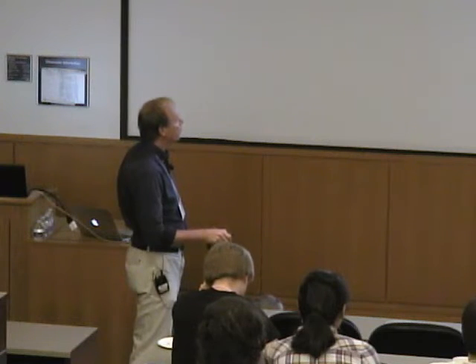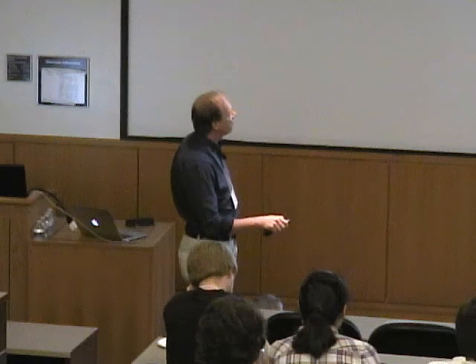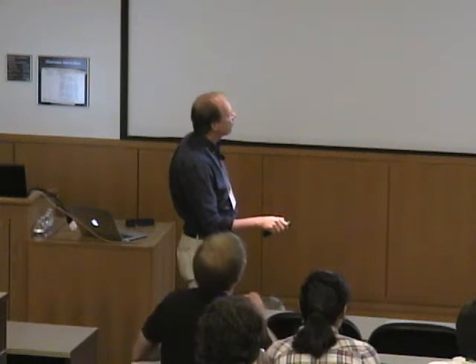And if we look at our iron(III) rhombogram and we go to the maximum rhombicity, you can see that in this part of the rhombogram, 3 transitions converge at 4.3, right? And so this is really characteristic of iron in a very asymmetric environment, right?